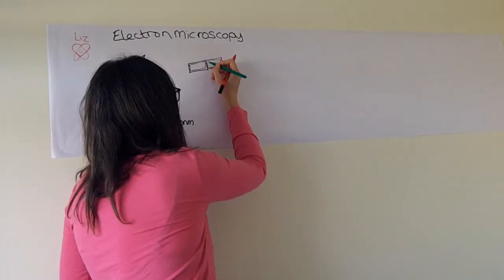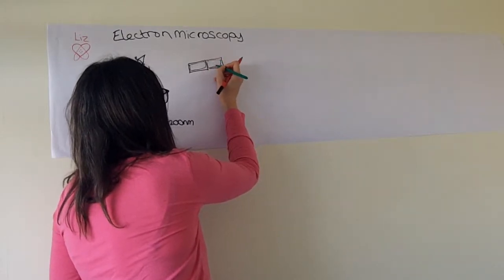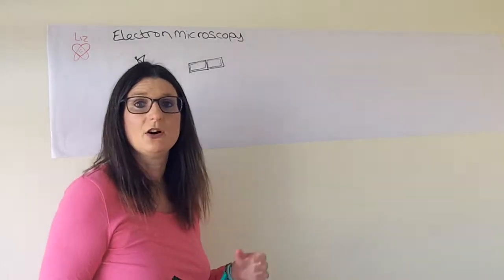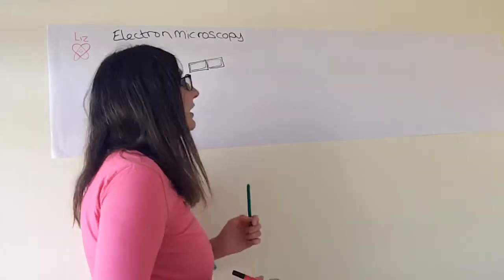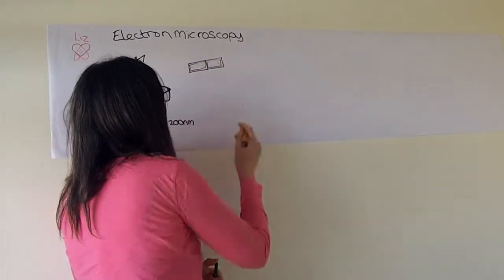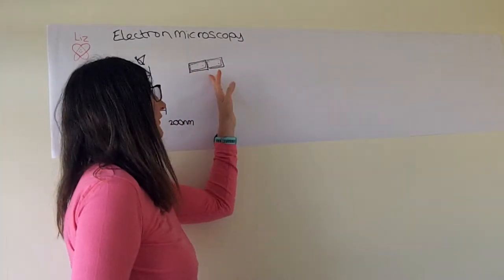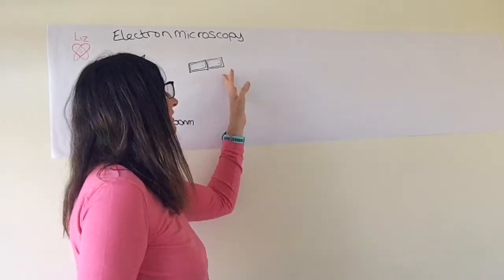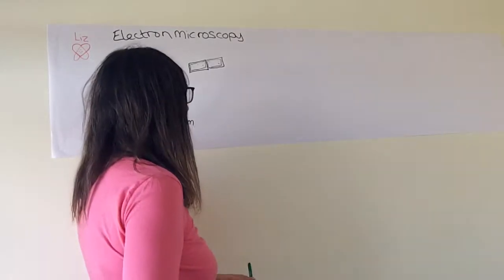It's what gives plant cells their green coloration. And those are called chloroplasts. I'm going to do another video on different kinds of cells and what's in them. You may see a nucleus. You're not going to be able to see much more than that on the onion cells because of the small scale that you're looking at.